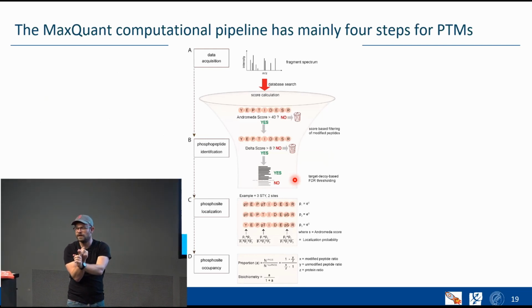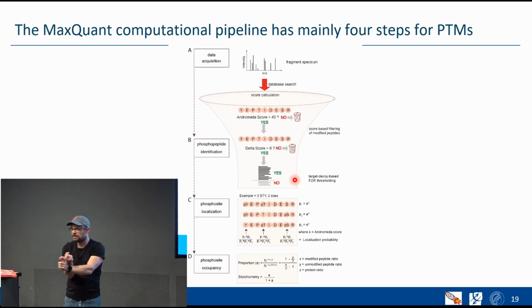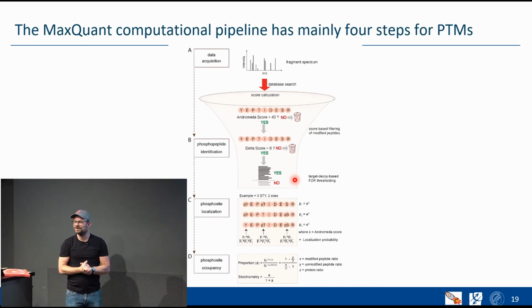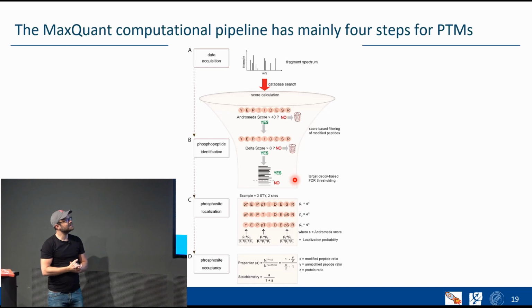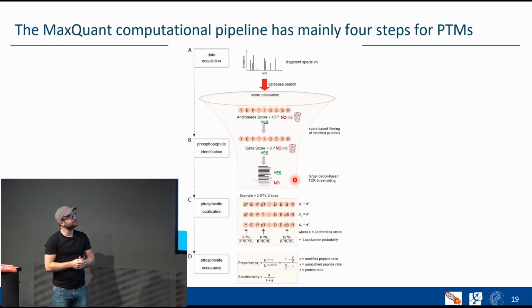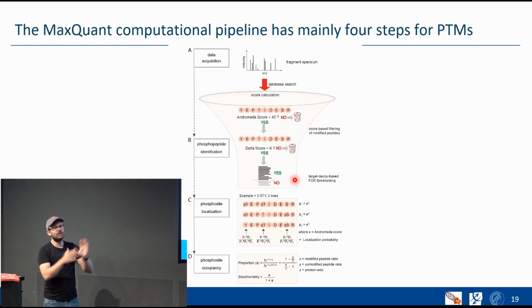We know about these fragmentation methods. You can also think about acquisition strategies, by the way. You can use MaxQuant Live global targeting for that, or even MaxQuant Live DDA. But anyway, we have our raw file, and now let's have a look at the pipeline.